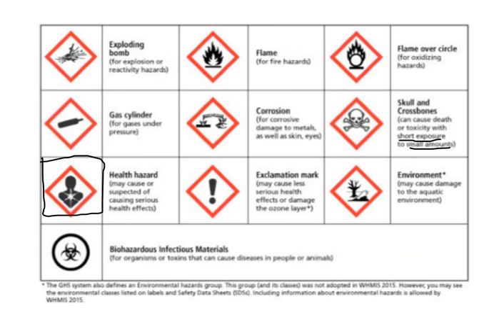This is a similar sort of thing there. These may cause less serious health effects or damage, like the ozone layer. I'm actually really not sure what they're going for here. And then here's the environment one. Here's the biohazard one.